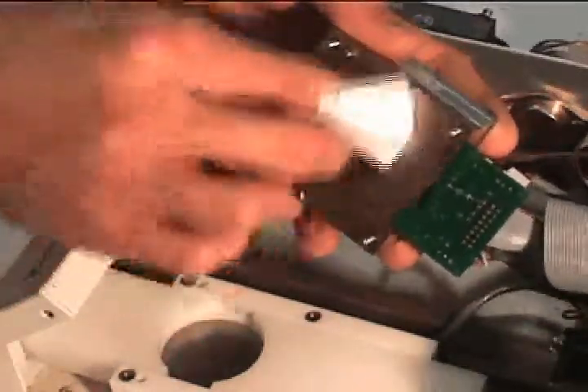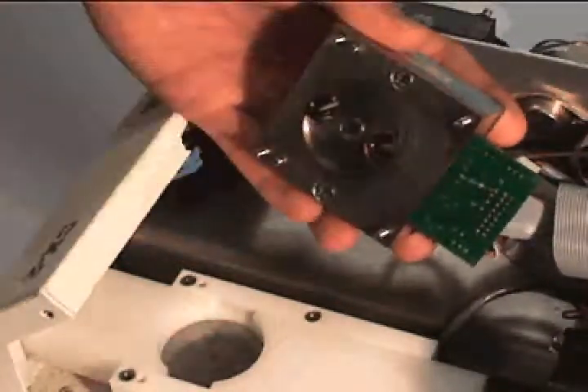Finally, clean the rest of the bottom of the sensor block. Be sure to remove any and all residue of sample contamination, especially where the cup seals against the sensor block.